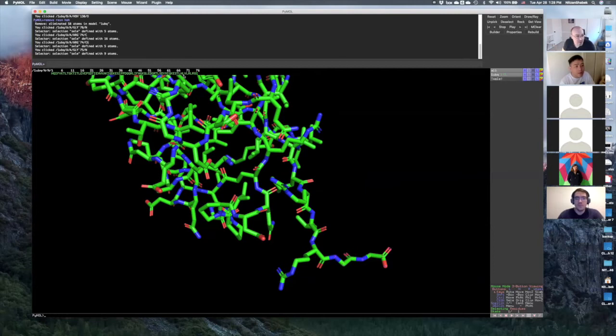The other option is to go to the command line and type select residues, in this case 75, 76. Here, that needs to be clicked. So that's the other option. Select basically means select, it's just an abbreviation of that. So these are the three options that you can use to select residues.